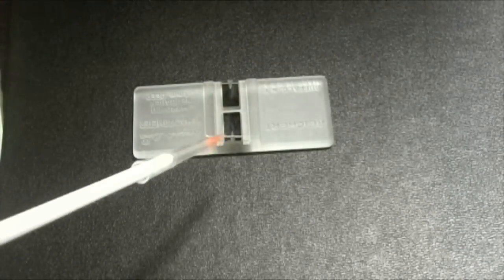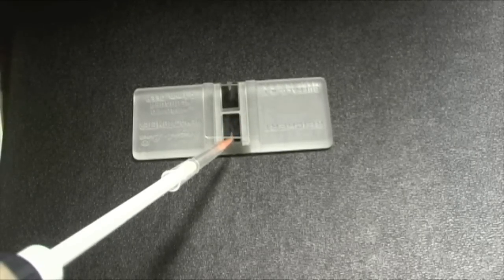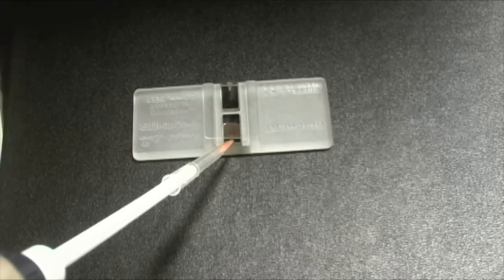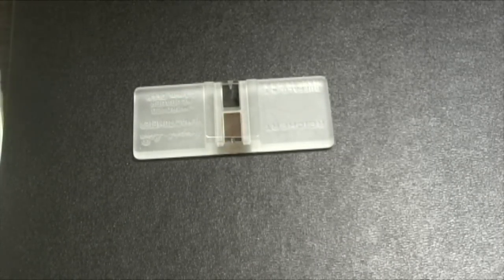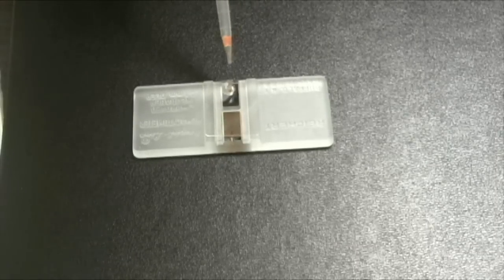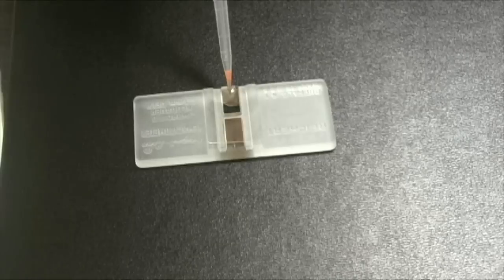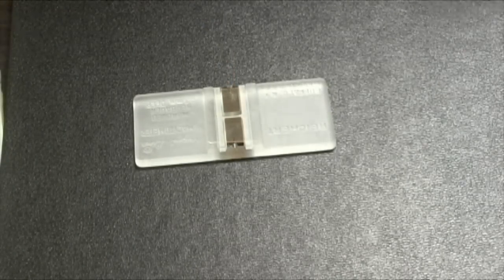Our counting grid is now in this area, and see these two small areas right here on the end? That's for filling the chamber. So we're going to very carefully pipette a small amount of sample in there. As you can see, it turned nice and orange because I used an orange dye. Now we'll come over here and do the other side. Be careful not to get any air bubbles in. Okay, now that chamber is full.